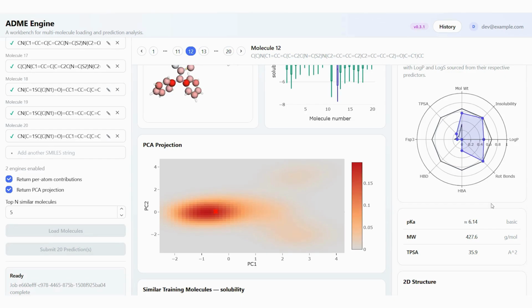I will now pass it over to Theo, who will explain our agentic AI roadmap and the future plans for our product. Thanks, Victor. My vision is that we will keep refining our model, and I already have two key upcoming features in mind: a lab data ingestion workflow and an agentic mode.